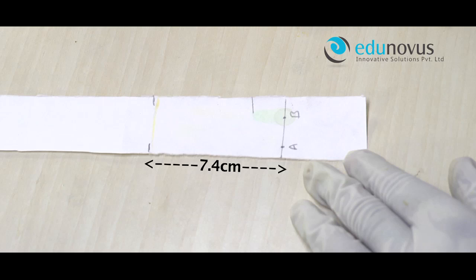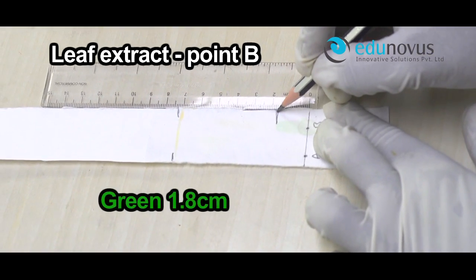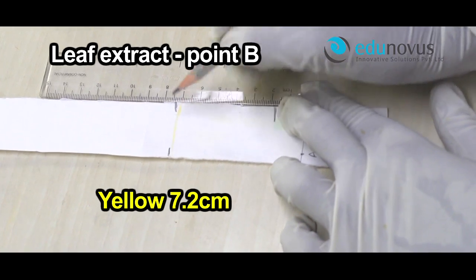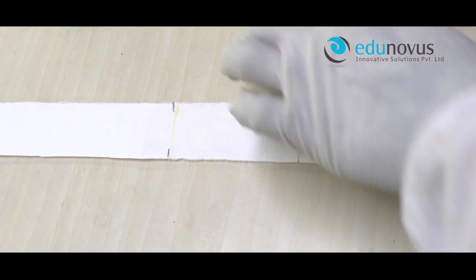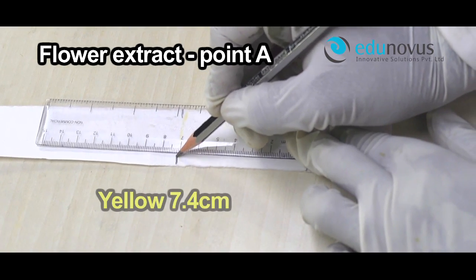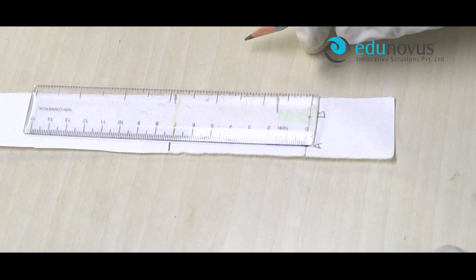In the case of leaf extract point B, we find two color spots: yellow and green. The distance travelled by the green spot is 1.8 cm. The distance travelled by the yellow spot is 7.2 cm. In the case of flower extract point A, we find only one color spot, which is yellow, and the distance travelled by the yellow spot is 7.4 cm. Tabulate these values in the observation table and calculate the RF values.